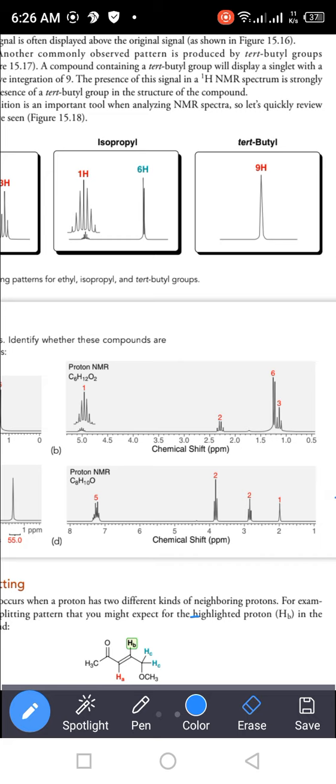Yes, they are justified. When they are justified, now at the end, look at the chemical shift value. So the chemical shift value having a multiplet, one proton multiplet is at 5. So 5 means this isopropyl group hydrogen must be attached with oxygen. Although there is no need to draw a complete structure, we just have to justify the fragments. But for your convenience, I'm giving a clue how to draw a complete structure.